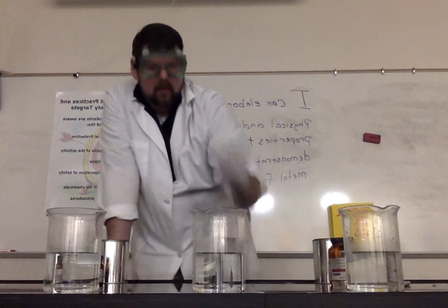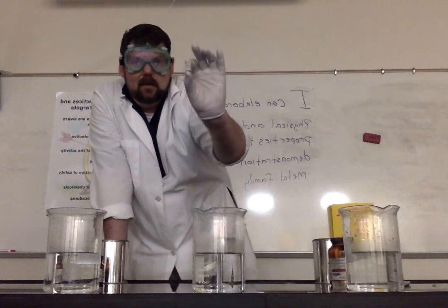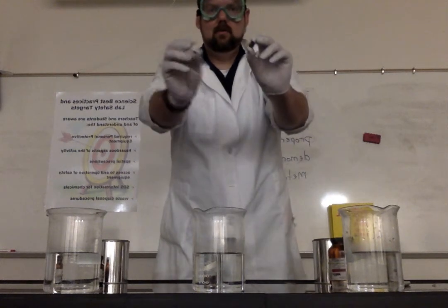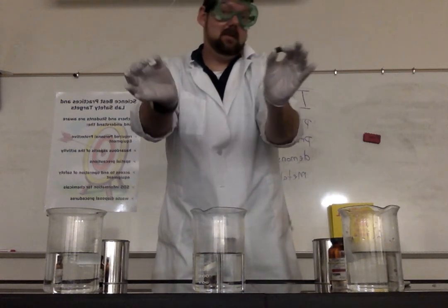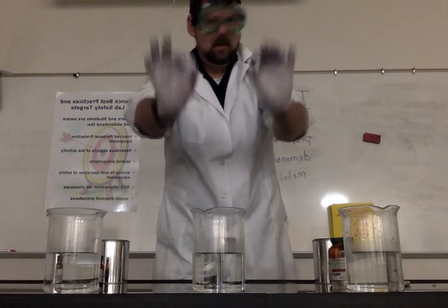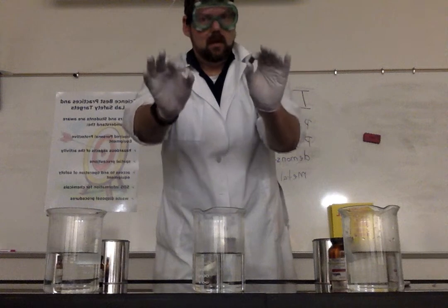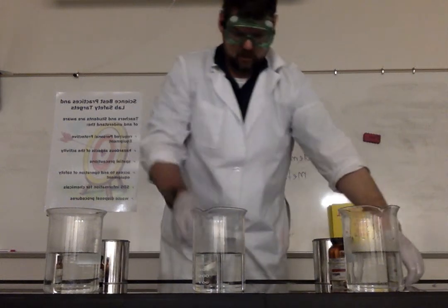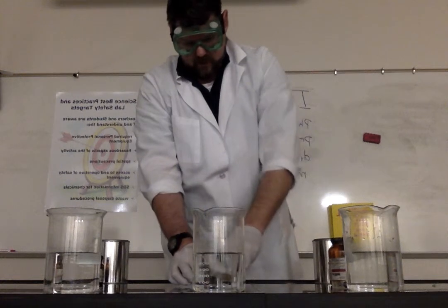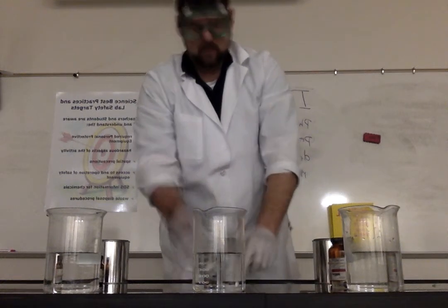Okay. Physical property. Right now you see it's white. Looks a little different than lithium, doesn't it? Black, white. Well, like I said, there's similarities. That's its tarnish. This tarnished as well. It rusted. Both oxidized, both are reactive to air. Notice I was able to cut this with a knife. Oh man, that was even better.